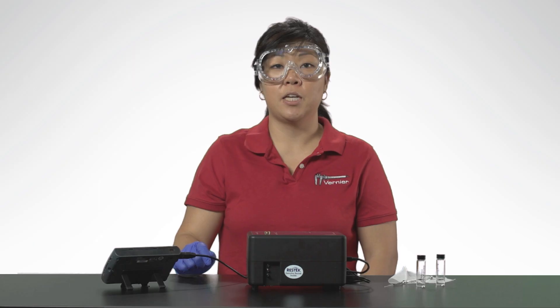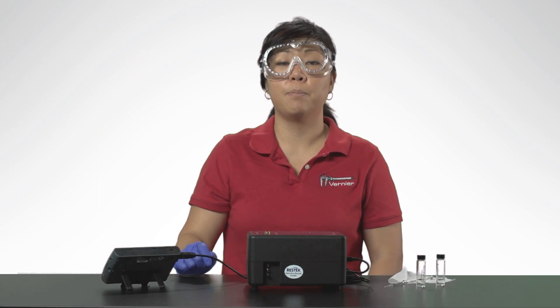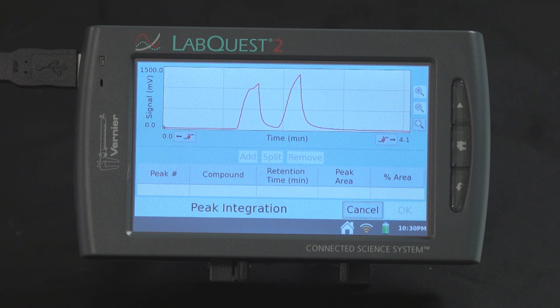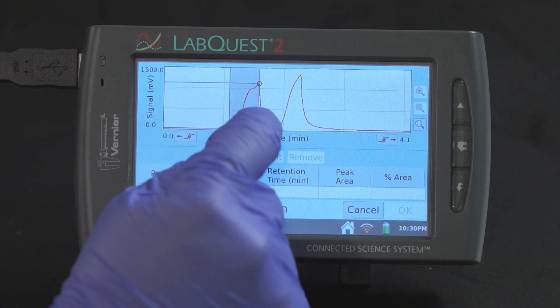To select and integrate the peak, drag across the graph from a little before the peak to point far enough to the right so that the entire peak is selected. Choose add.